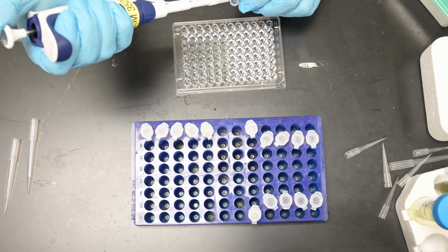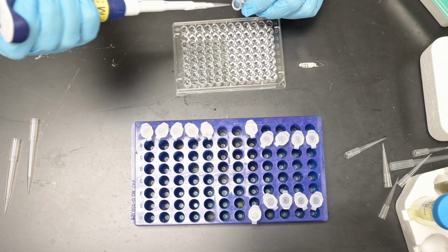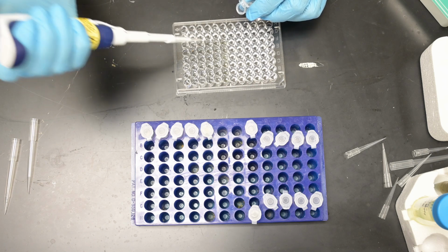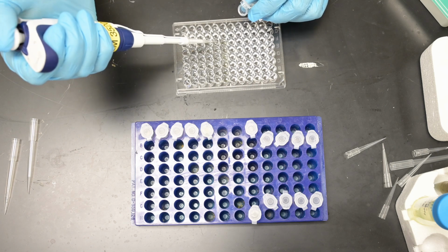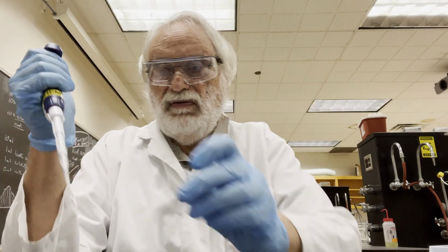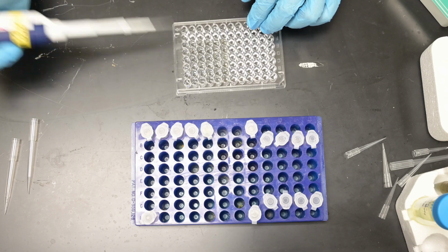But unfortunately, or maybe fortunately for this, the enzyme concentrations aren't high enough, and we're not seeing that rapid of a reaction, so they're pretty slow. So now I've gone through and I've added enzyme to all of these wells.